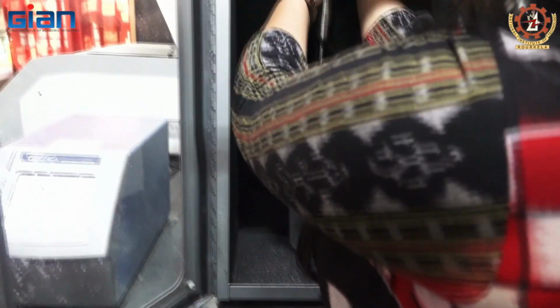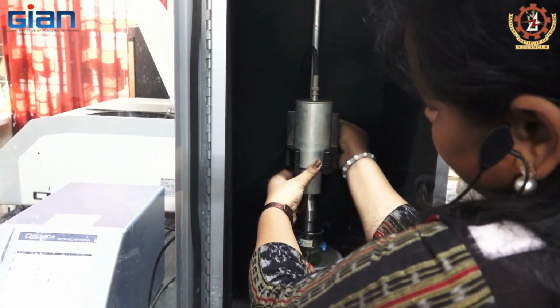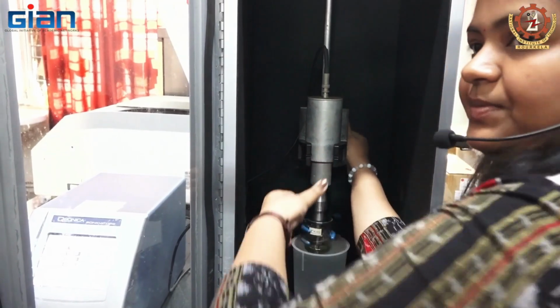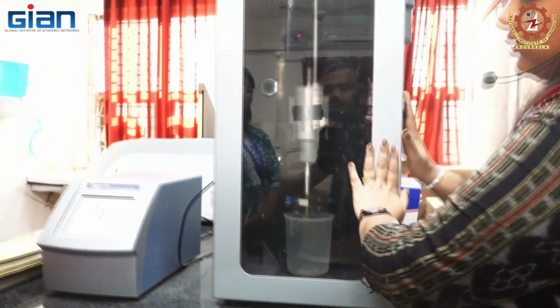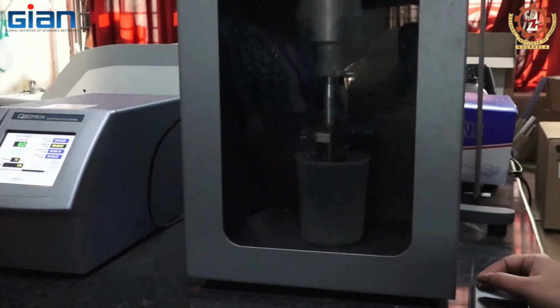And I put the probe inside it. It should not touch the bottom of the vessel, otherwise it will be broken. Okay, then we will keep it closed. Enter. It will start.